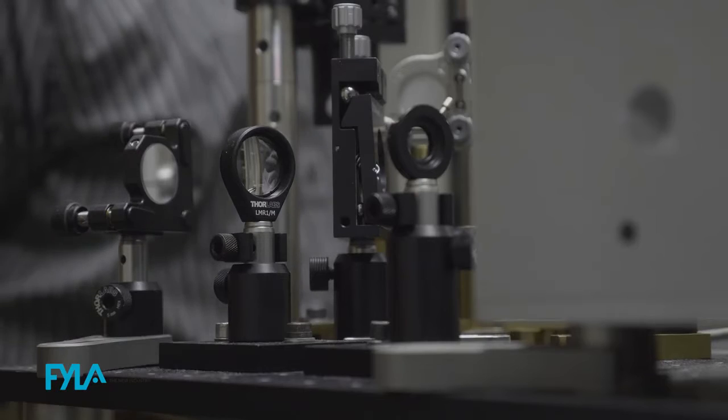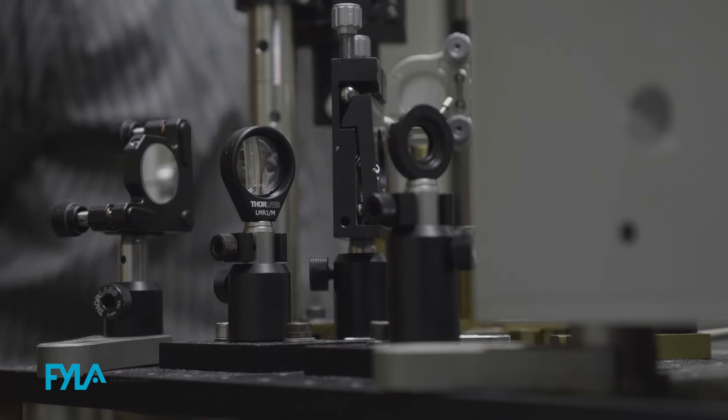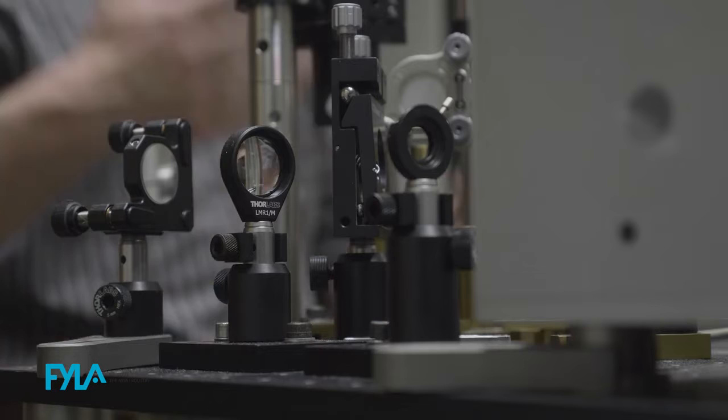So second harmonic generation is a self-sectioning microscopy technique, which means that you don't have to worry about spatially filtering where you're looking to in the sample. You're only looking at the focus of the microscope objective. So you're able to look layer by layer by layer without having to introduce anything other than a detector into your detection arm.